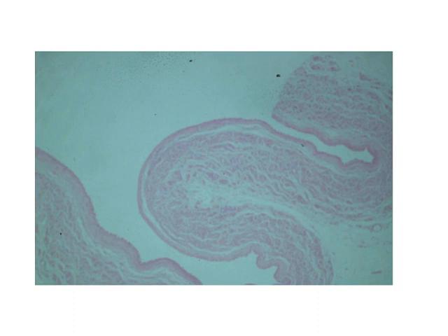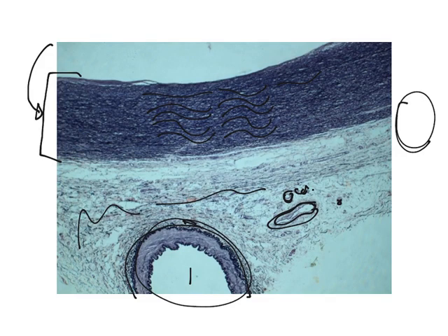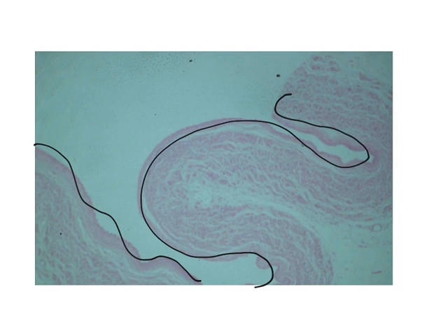This here is a section through the vena cava. Again, the vena cava is very large. You're not going to be able to see the whole thing, but what you want to emphasize, look at, again, I don't see a lot of elastin fibers in there. This kind of doesn't maintain its shape very well, kind of folds upon itself. Veins without the blood in there are not going to be able to maintain their shape. The aorta pretty much maintained its shape, as you can see there. So this here is the vena cava.